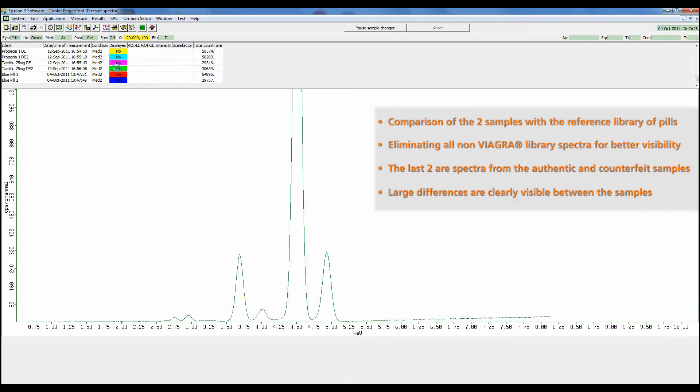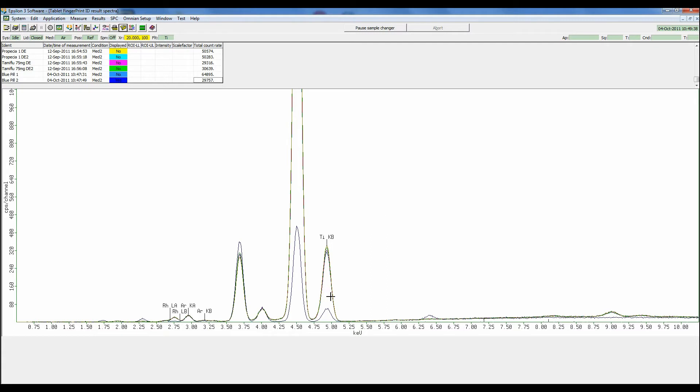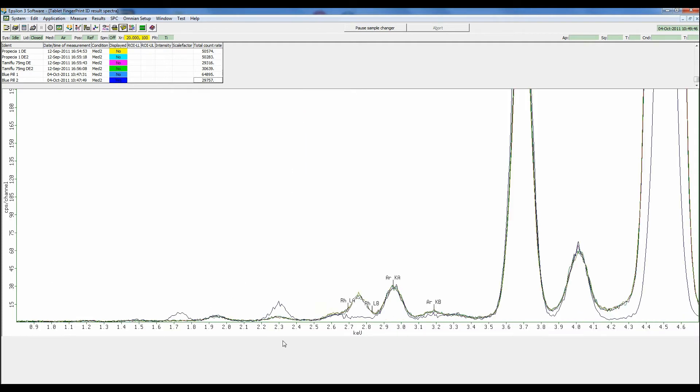And finally, here is our real Viagra, and we see no difference. Now we see the reason why our suspect is a fake. We see reduced titanium, some elevated iron, and in the light element area, we can see some silicon and sulfur.